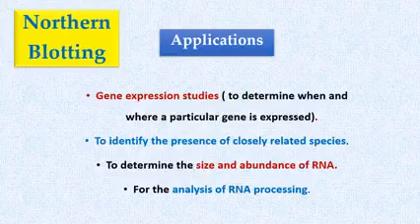Modern methods such as PCR have replaced the methods of Southern and Northern blotting. This is because PCR and PCR-based techniques are simpler, quicker, and more precise.